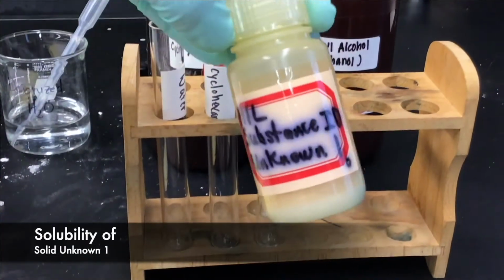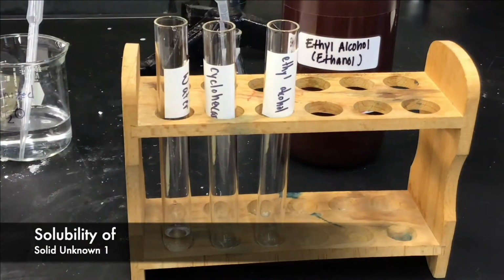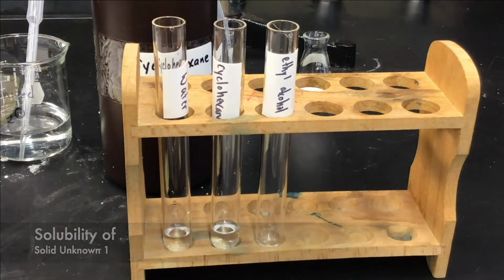Now we're going to move on to our unknowns. Our solid unknown, 1. And just like with naphthalene, we're going to put 2 to 3 milliliters of water, cyclohexane, and ethyl alcohol in the respective labeled test tubes.